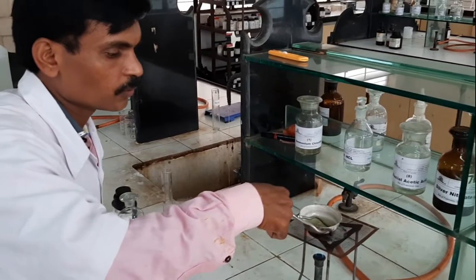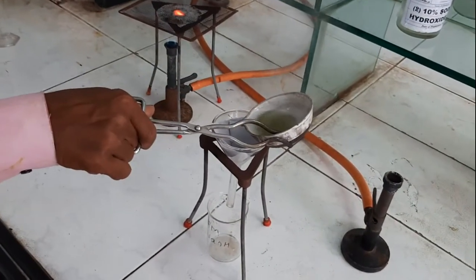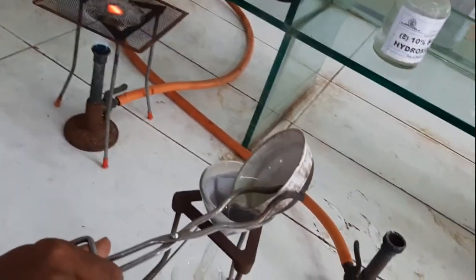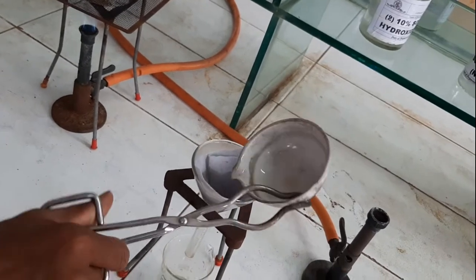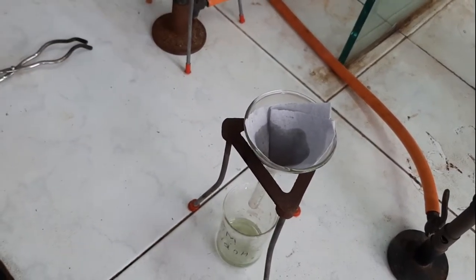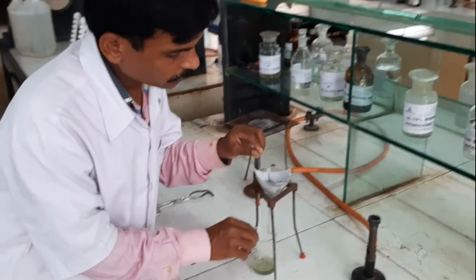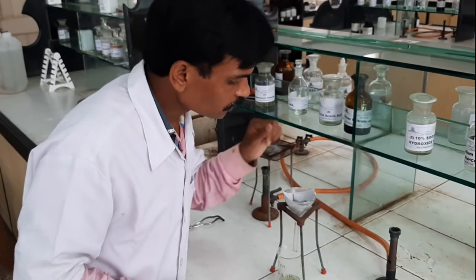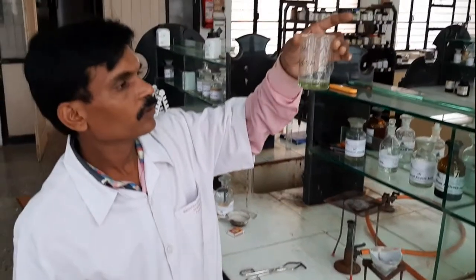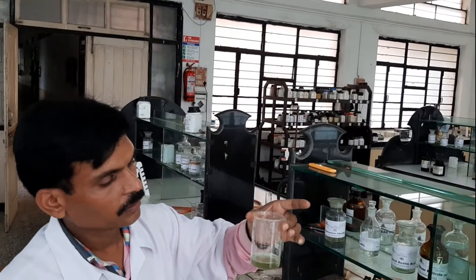After complete concentration, we will filter the solution and allow it to cool. Whatever impurities or unreacted iron impurities are present will remain on the filter paper. We will get the filtrate solution — a clear green-colored solution of ferrous sulfate.